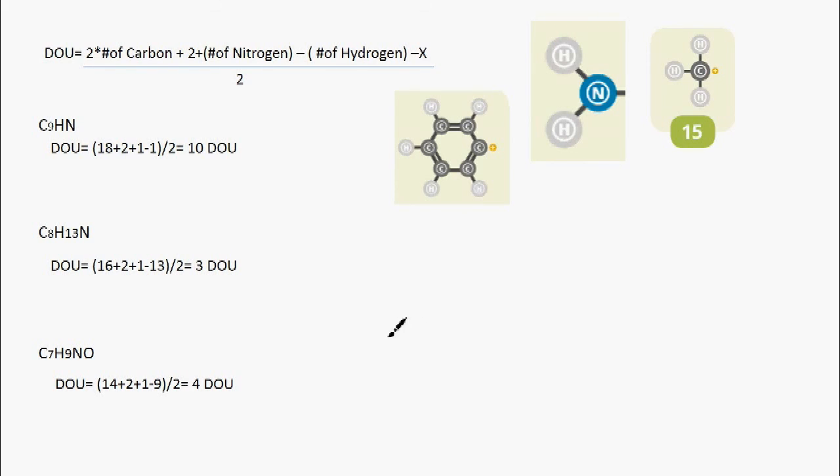One with our nitrogen on this side, and then at any point it could be bonded. We could have our oxygen bonded to any of these. However, that's not the main thing that I'm talking about, because that oxygen could just as easily be bonded to any one of these. So the other group that we're possibly looking at is back to that benzene, with either the nitrogen on this side and then oxygen methyl substituent, or the opposite being true, with it being the carbon and then the oxygen and then the nitrogen substituent.